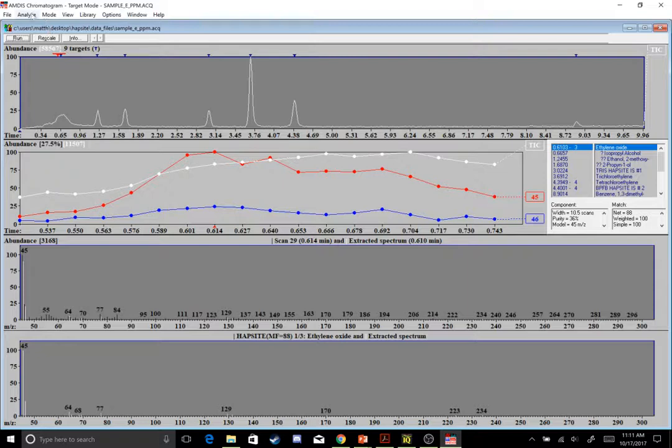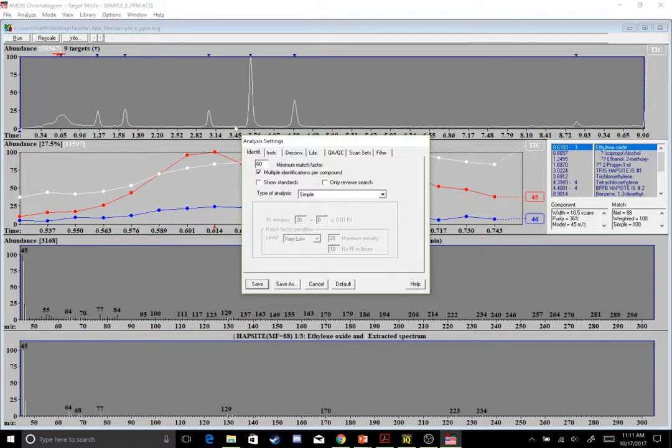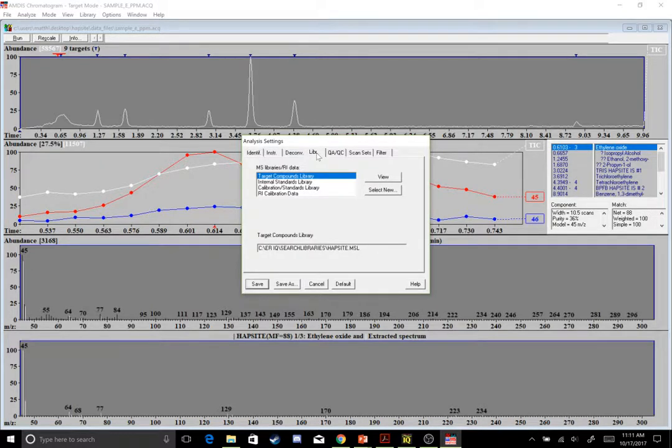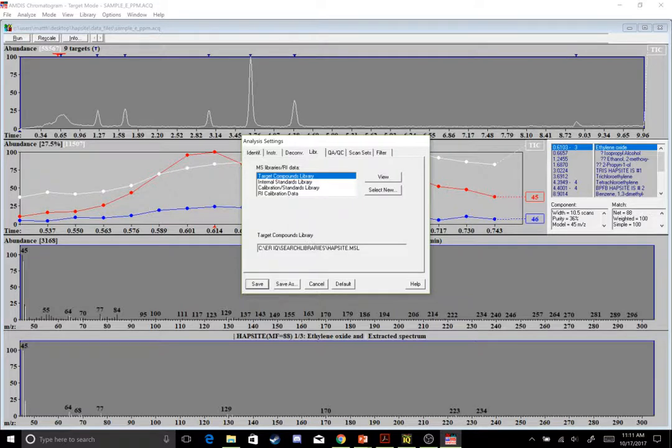I'll go to Analyze, Settings, and then my library over here. I've seen a couple computers whenever it has your target library compounds already set up, it generates a pathway right here. So C Drive, ERIQ, Search Libraries, and then I have HapSite MSL as my library that's actually searching.